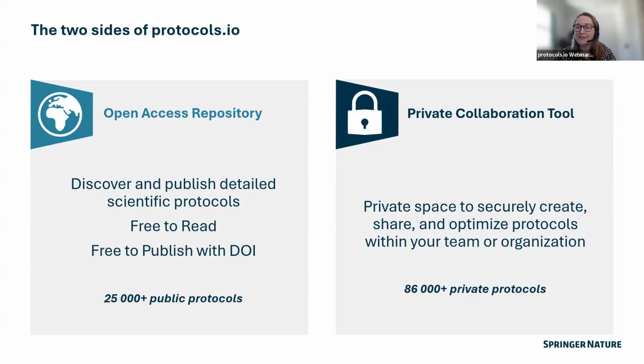One of my coworkers is joining at the moment. This is where you can store, create, and have your protocols. Let me just spotlight myself.